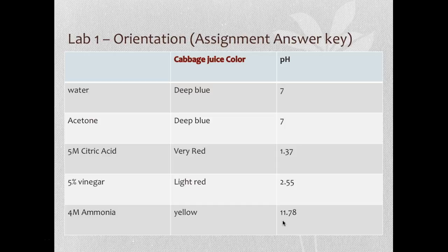Okay, and if you do another base such as the soda bicarb, you could compare ammonia and the soda bicarb to see how basic, because soda bicarb is a base, so you could compare it with ammonia to see which one is the stronger base or the stronger alkali.